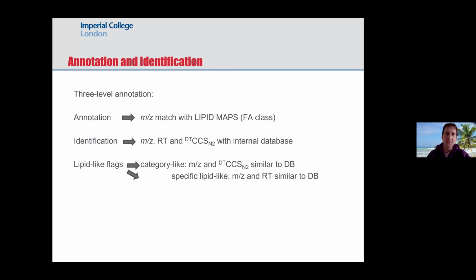In terms of identification, we were comparing to standards, and then we compared an exact mass, a retention time, but also the CCS value in terms of detecting that. And then we'd cross-validate that with fragmentation patterns as well.